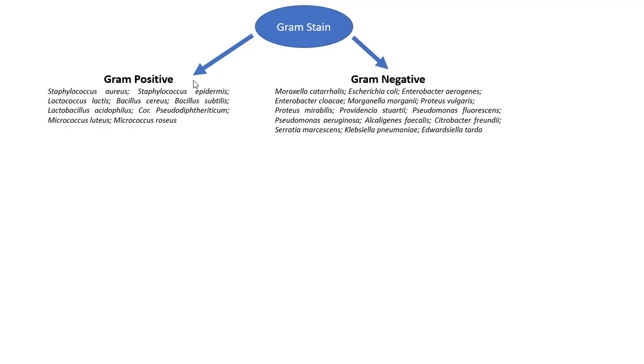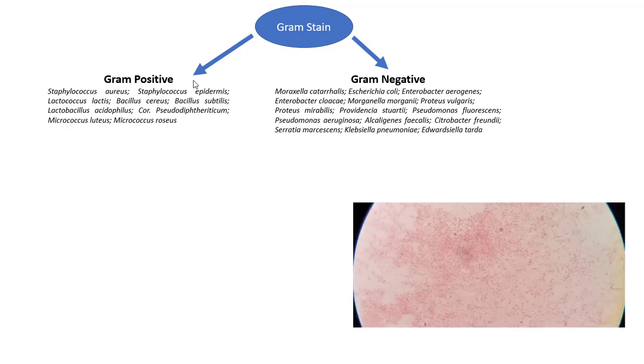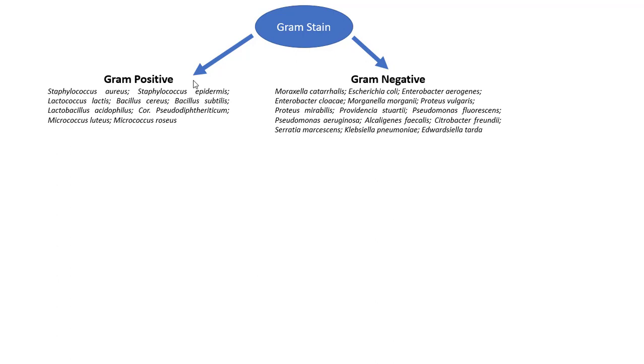Let's pretend that you performed your gram stain and your cells stained red, indicating that your bacteria is gram-negative. You would need to indicate this on your flowchart somehow. For example, you could use different colored arrows, blue indicating the result you obtained, red indicating that those bacteria are no longer possibilities. You could also indicate this in other ways. For example, you could place an X through the arrow, indicating that your bacteria was not gram-positive, but was gram-negative. Another option would be to use a T-head, showing that these bacteria are no longer possibilities and that we will be carrying on down this lineage.